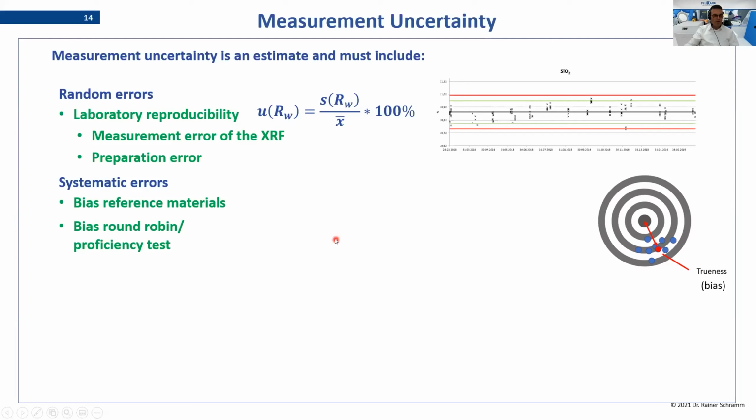For the systematic error, I give you an example for a theorem. There are different parts of contribution for our uncertainty. And the first thing we have to see is that the measurement here has, of course, a distribution. And this distribution has an error, which is here the standard deviation of these values. This standard deviation is divided by the square root of the number of measurements, and this gives you the uncertainty of this measurement error.